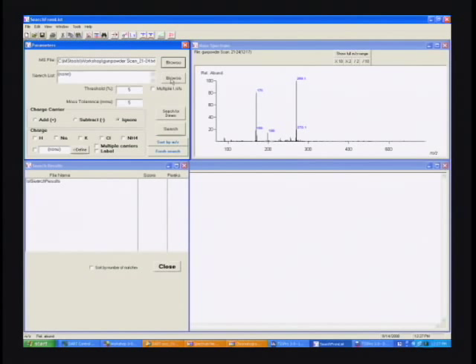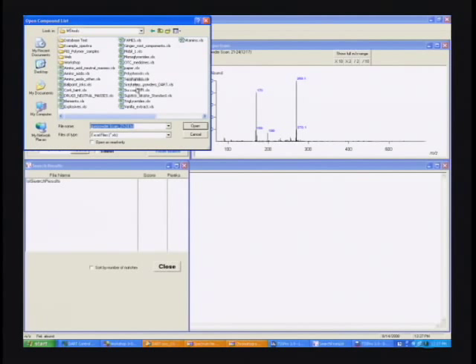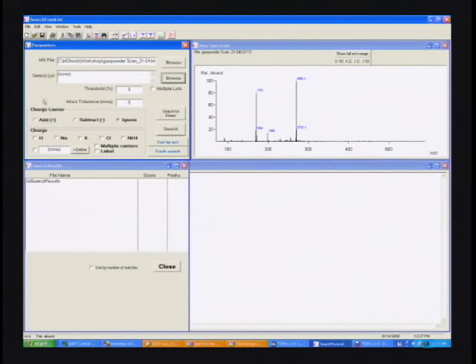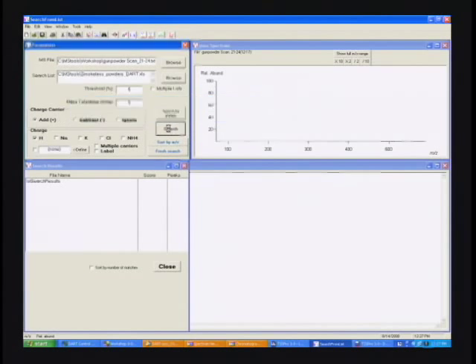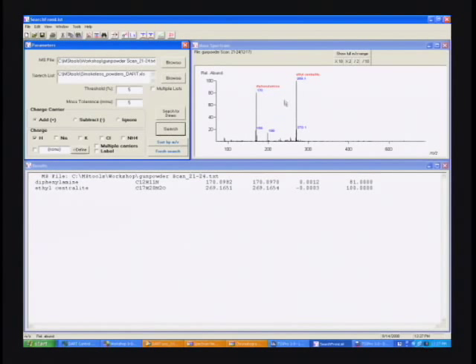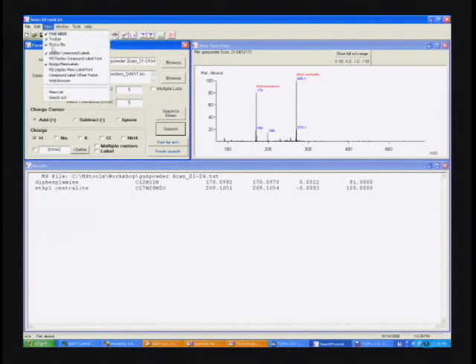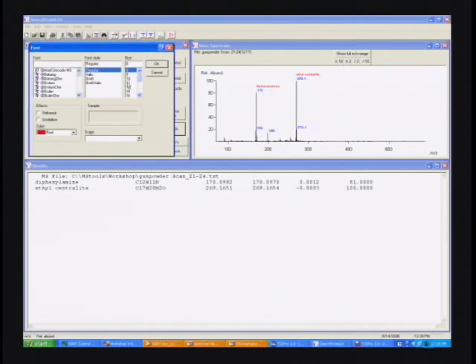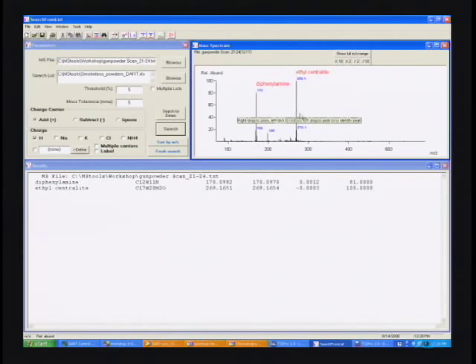Now let's give this a list of things that might be in gunpowders. We should have a list of smokeless powder components. We'll go ahead and load the file. It's got things like dinitrotoluene and diphenylamine and all that kind of thing in it. Now let's search the spectrum and see what we found. Two things showed up. Let's make the labels a little bigger so you can see them.